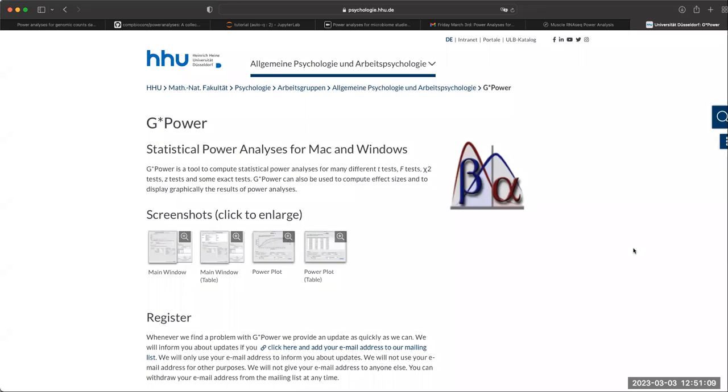I did that in the notebook because I was asked to see if they could increase sequencing depth. But obviously, at some point you sequence deep enough that there's no more effect to be determined.